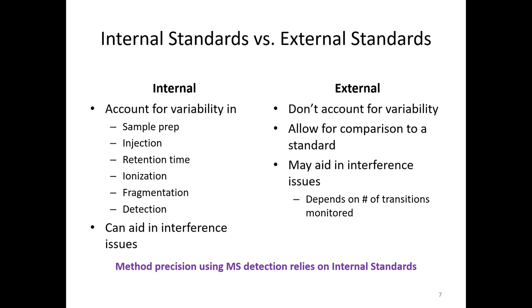As we talked about yesterday, the relative intensities of the product ions have to match between light and heavy. There's no reason why they should not, except for two reasons. One is interference. Does anyone know what the other reason is? So these patterns that the peptides produce when they're fragmented should be identical all the time, except for interferences, which we learned yesterday.